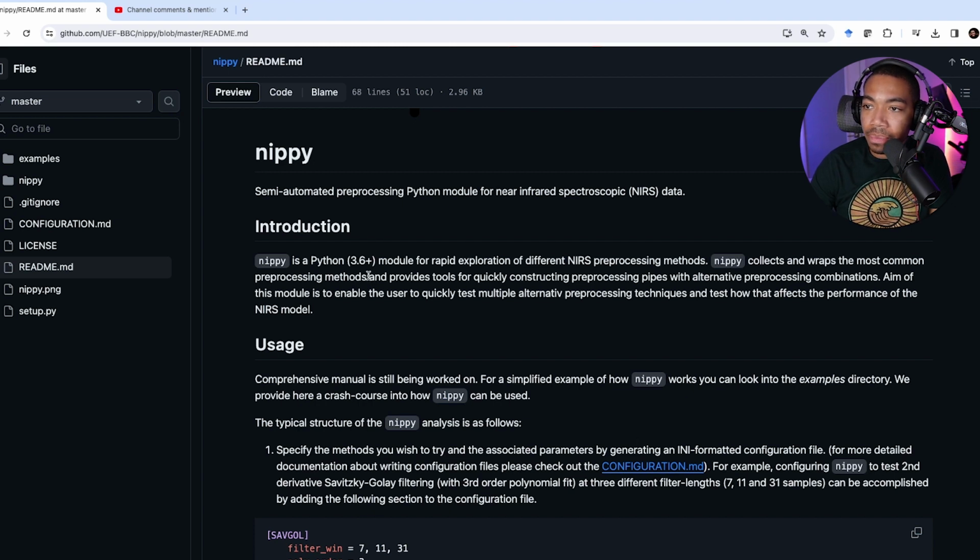I think this is likely going to use techniques you may have already shown. If they're wrapping, usually when you see this, they're going to be wrapping things like SciPy, perhaps statsmodels, NumPy, things like that, where there are already some tools that exist, but this is kind of packaging them all together and making it more convenient, wrapping them for use, particularly for this sort of data processing.